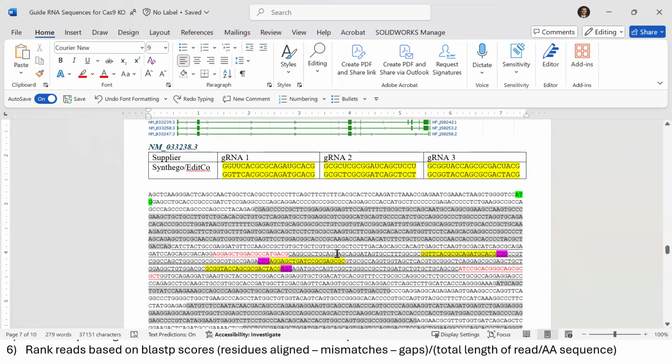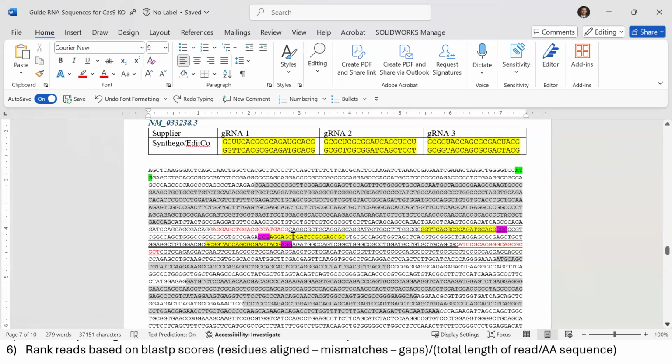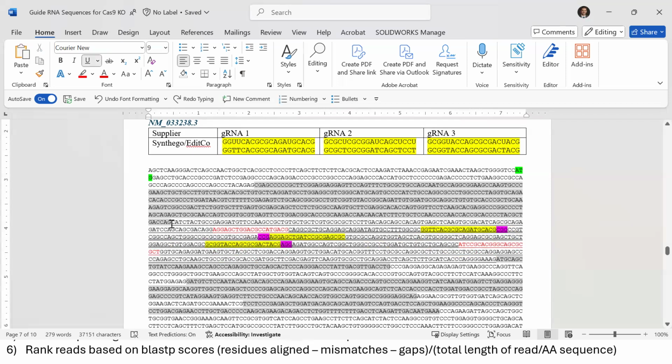So with that in mind, we're targeting this 3rd exon. I mentioned to you before, we're going to amplify this target sequence using PCR. I don't have my primer sequences shown here because this is a transcript sequence. So the intervening introns have been removed, but I can tell you our forward primer is a few dozen bases upstream of this junction here. And then our reverse primer, it starts right about there.